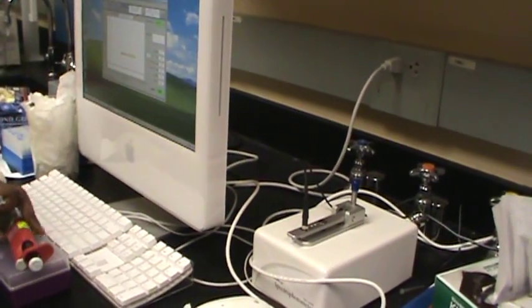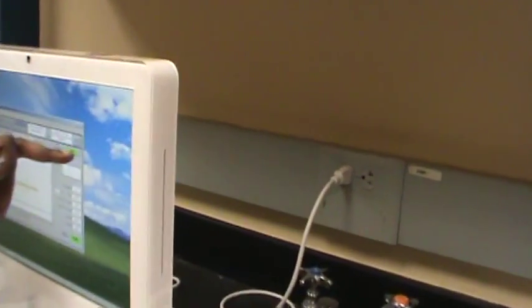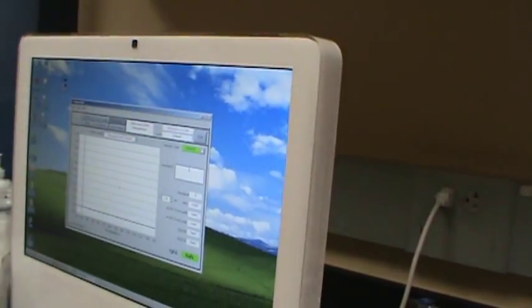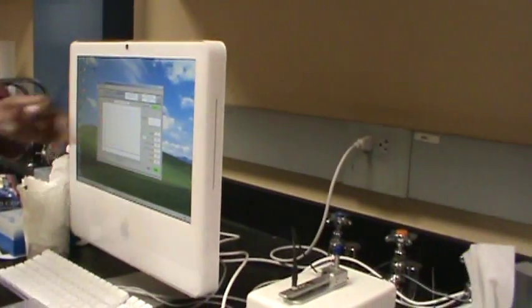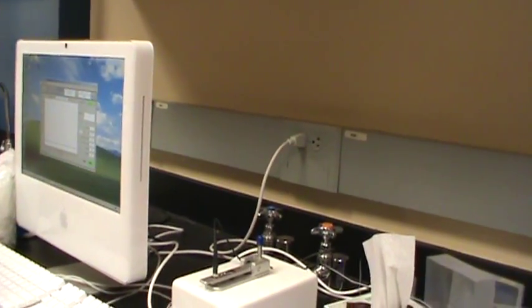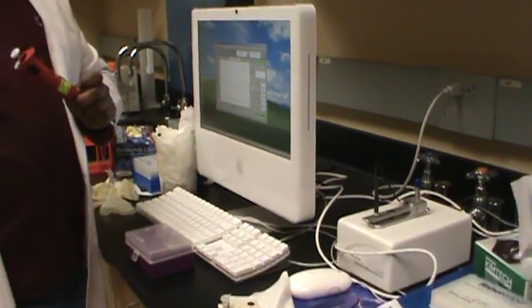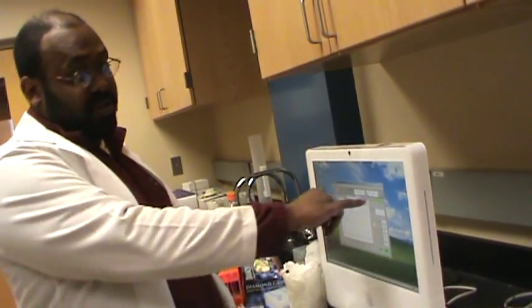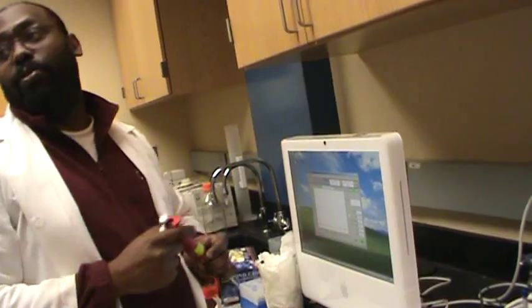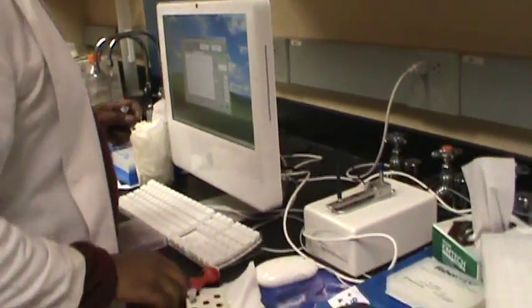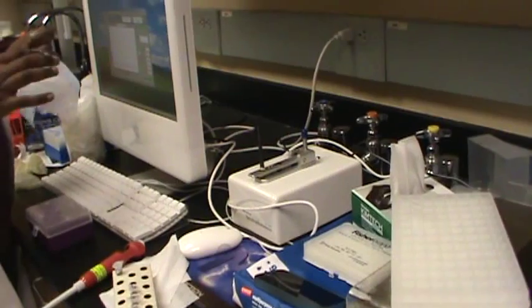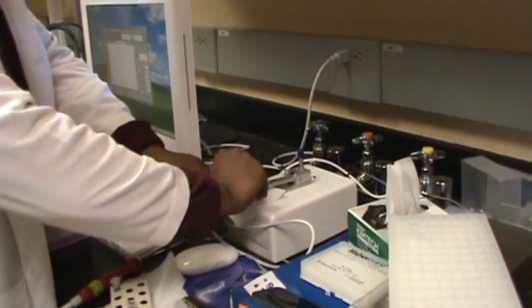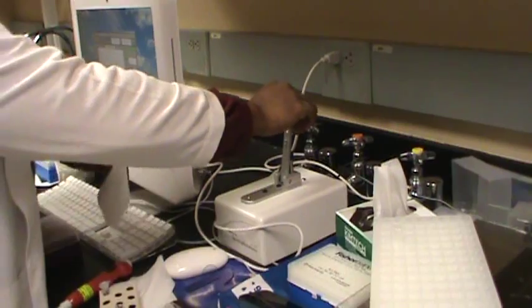Now make sure it's on DNA and 50. Fifty is the standard concentration for double-stranded nucleic acid DNA. RNA is 40. It's based on the extinction coefficient when you use a one centimeter cuvette at OD 260. The machine already knows that formula. So 50 micrograms per mil is the standard concentration form for DNA.